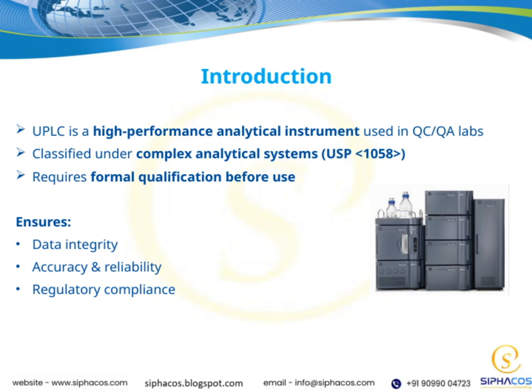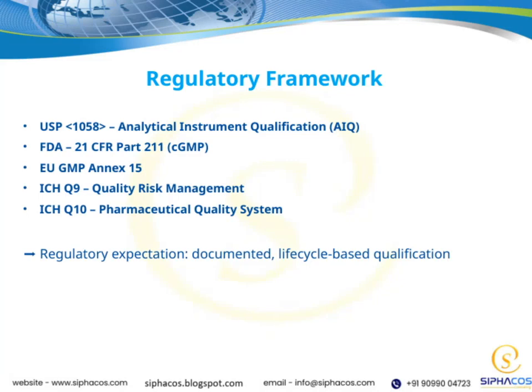This is vital in the pharmaceutical industry, where adhering to strict standards is not just a requirement but a responsibility. Overall, understanding these aspects highlights how UPLC is a powerful tool that, when properly qualified and managed, upholds the highest standards in analytical testing.